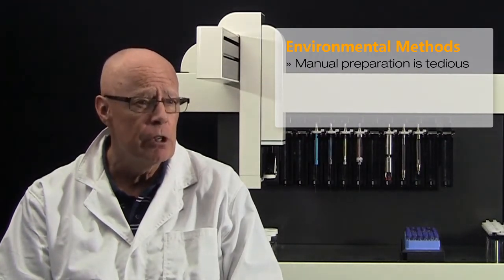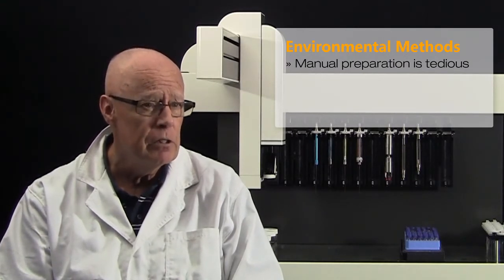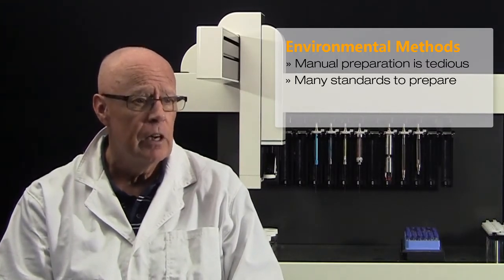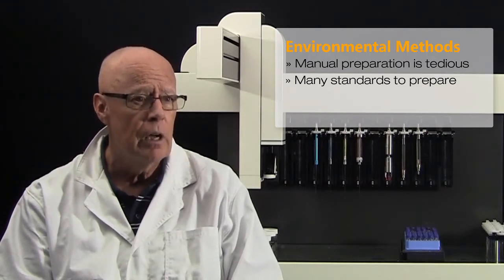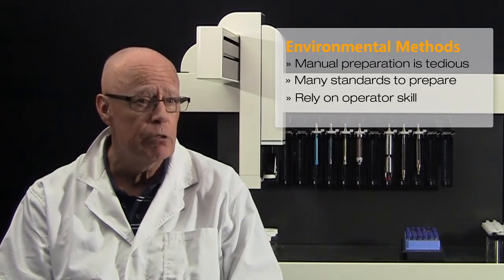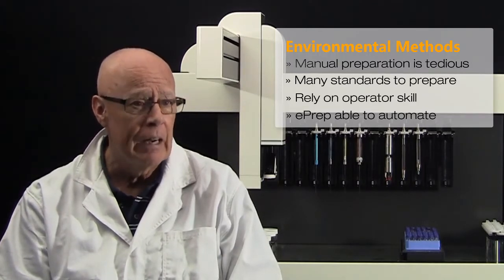The standard operating procedures for these methods will vary from lab to lab, but there will be intermediate standards and standards prepared for a working level range, possibly up to 8 concentrations. And some labs will even have to prepare another set of working standards at a lower working range. So manual preparation is time-consuming and boring, and it relies on the skill of the operator for precision and accuracy. As we'll see in this demonstration, the ePrep is able to automate these procedures for reliable, reproducible, and unattended operation.